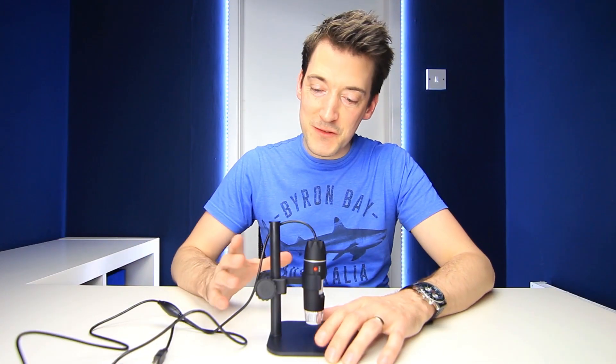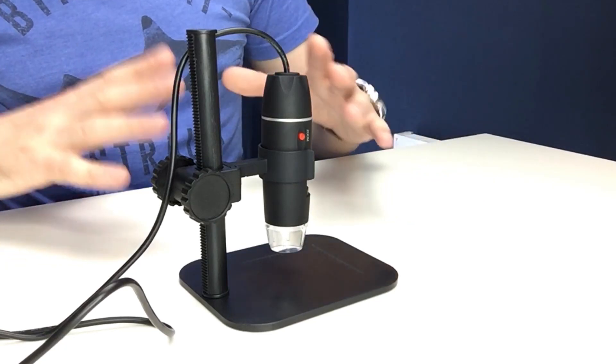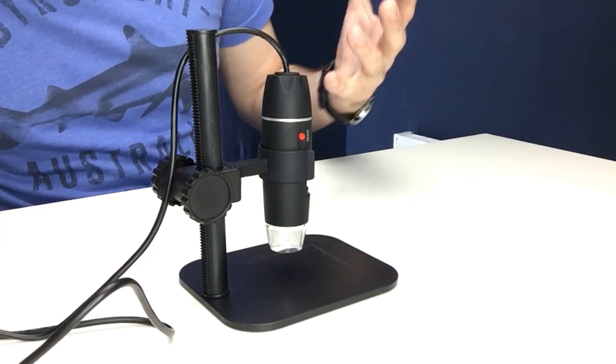So there we go — that was a quick demonstration of the USB digital microscope in action, and I was very, very happy with how that performed. Yeah, it's not perfect, it does have its flaws — for example, it isn't in HD — but again, for the price of this, you can't really expect that, and you could still clearly see what was going on.